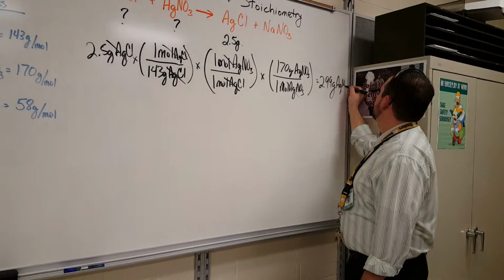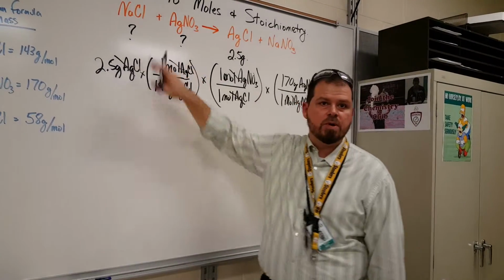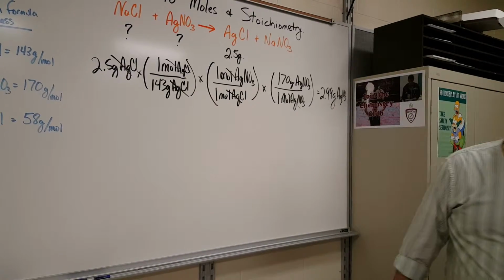And I'm going to go start weighing that out while you do the next calculation, so you know how much salt, sodium chloride, to add. Yeah, I'm going to go weigh that out. Okay, good, while you work on the next calculation.